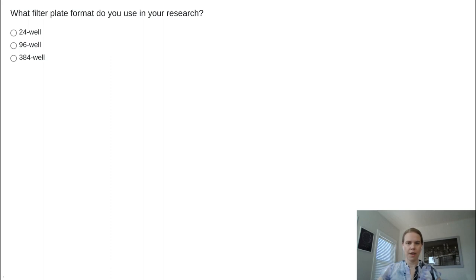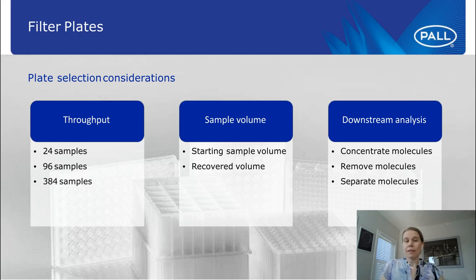With regards to the plate selection consideration, I would like to talk about three things or three aspects that may help you when it comes to which filter plate I should select. And these are really straightforward things that I will mention. First of all, is throughput, really just to know if you're working with high throughput sort of workflows that you are processing many samples.